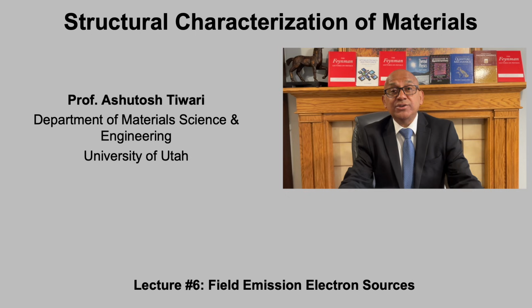In the previous lecture, we saw that the electron source is the most critical component of a scanning electron microscope because it fundamentally determines the brightness, stability, and energy spread of the electron beam. We studied thermionic emitters in detail and also briefly introduced field emission sources.